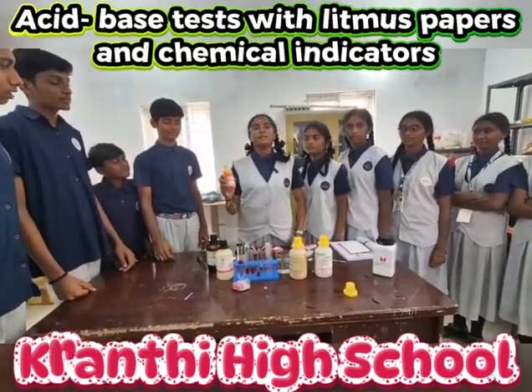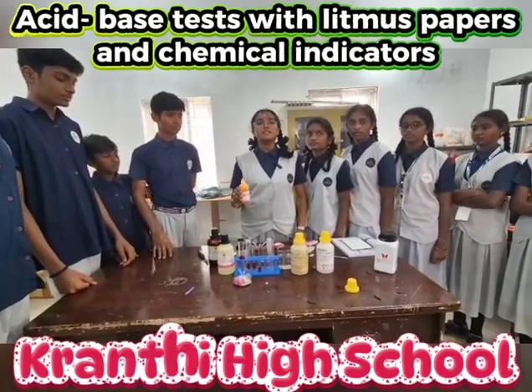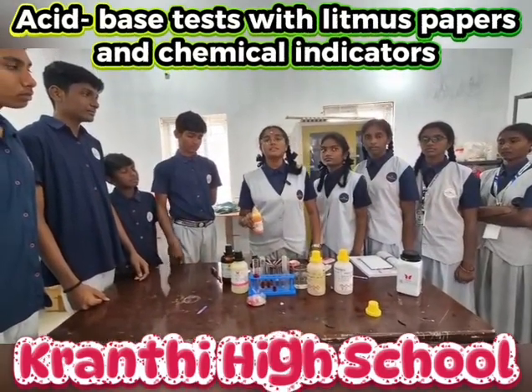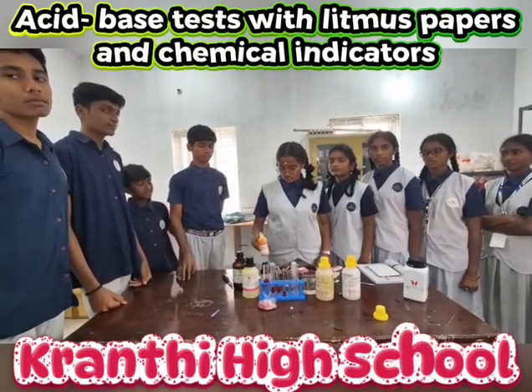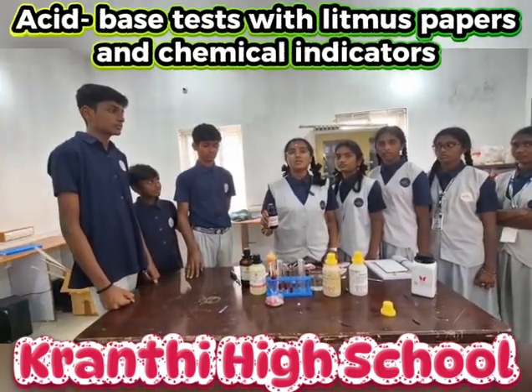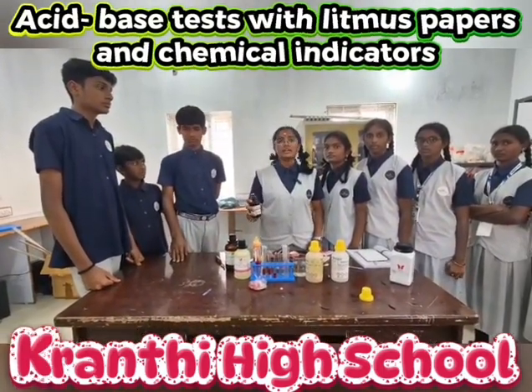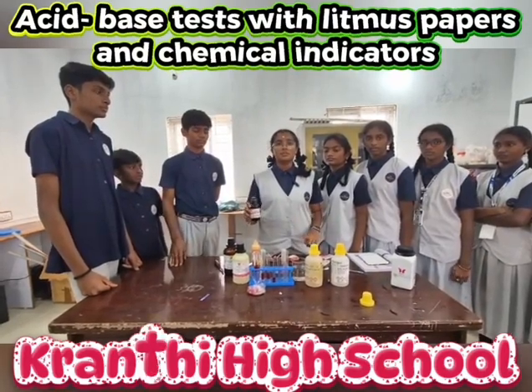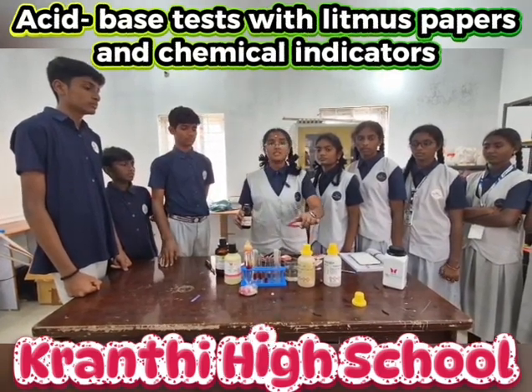If we add methyl orange to acid, it turns into color red. We can consider that as acids. If we add methyl orange to bases, we can consider it as bases if it turns into the color yellow. If we add phenolphthalein to acids, it shows no change of color, so that we can consider it as acids. If we add phenolphthalein to the bases, it turns into pink color, as you see here.